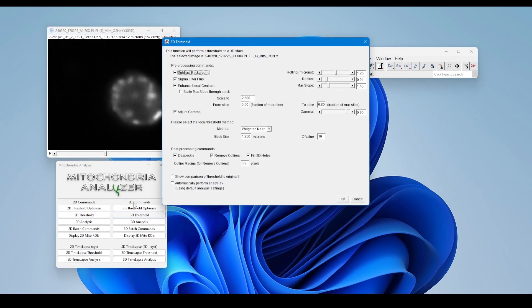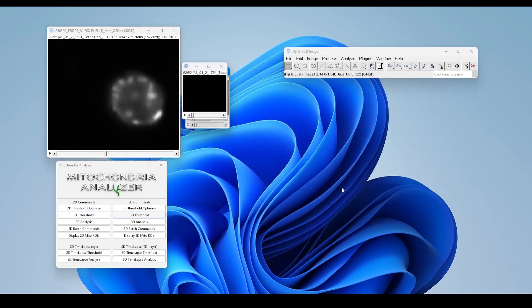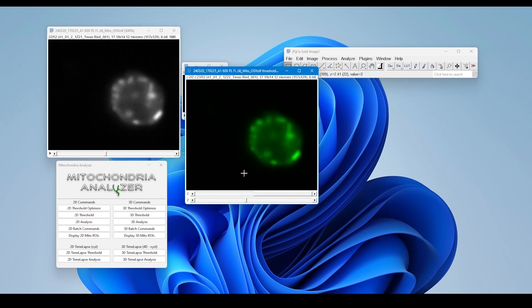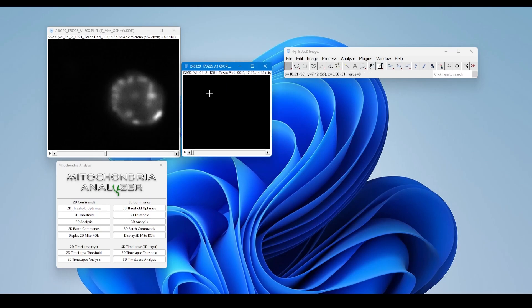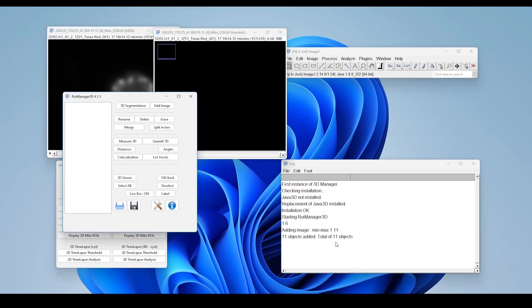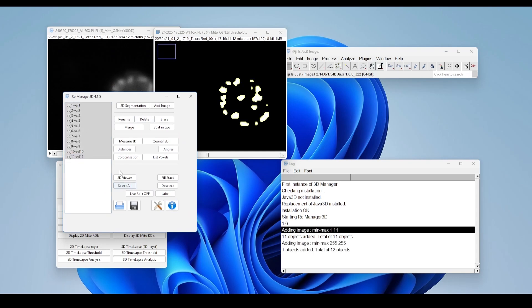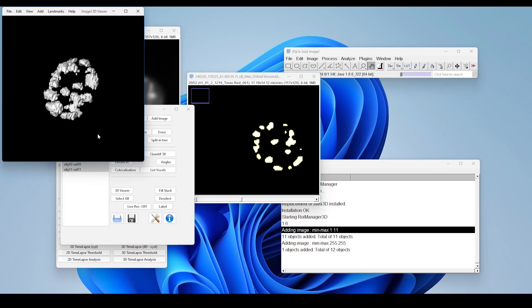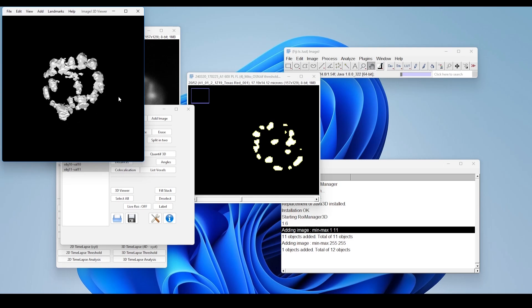Next, let's threshold the image. I'll change the settings — 1.2, 1.1, and 3. One nice thing I like about this is that it allows you to visually check how good your threshold is. Then the next step is the threshold image binary. Let's view this in 3D to get an understanding of what it looks like in 3D space. Here you can see the three-dimensional thresholded shapes of the mitochondrial intensities.